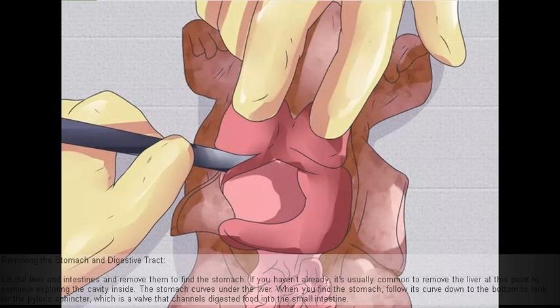Removing the stomach and digestive tract. Lift the liver and intestines and remove them to find the stomach. If you haven't already, it's usually common to remove the liver at this point to continue exploring the cavity inside. The stomach curves under the liver. When you find the stomach, follow its curve down to the bottom to look for the pyloric sphincter, which is a valve that channels digested food into the small intestine.